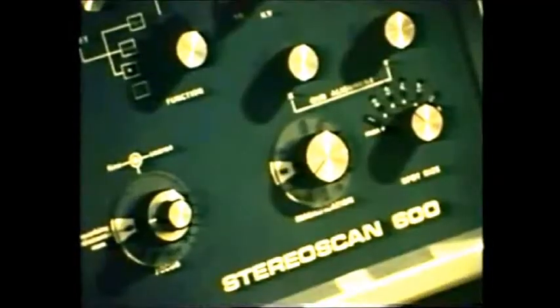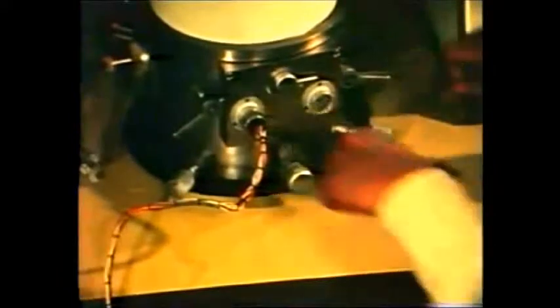The normal facilities of the electron microscope provide the opportunity to examine any chosen area in great detail. The device you have seen in operation is an example of a good component. It will now be removed from the microscope and replaced by one which is known to contain a fault.